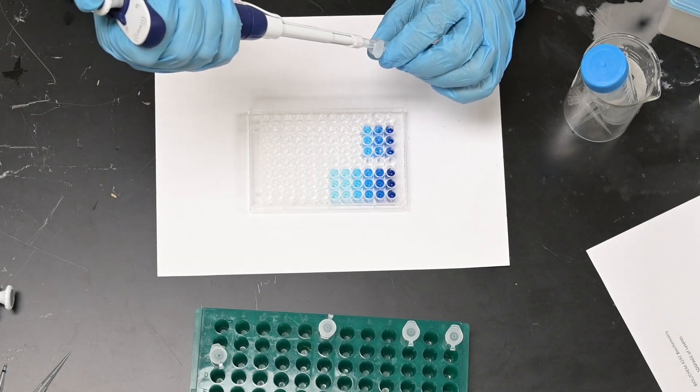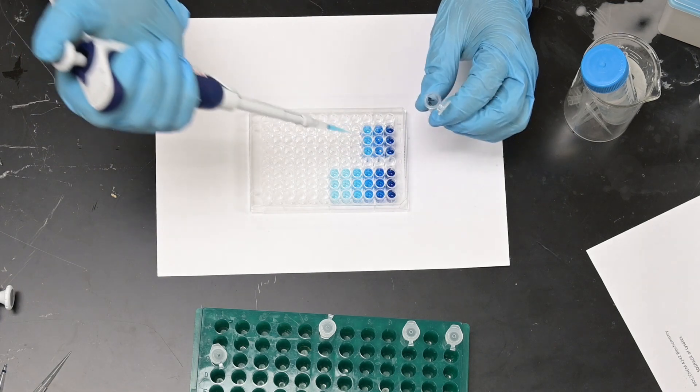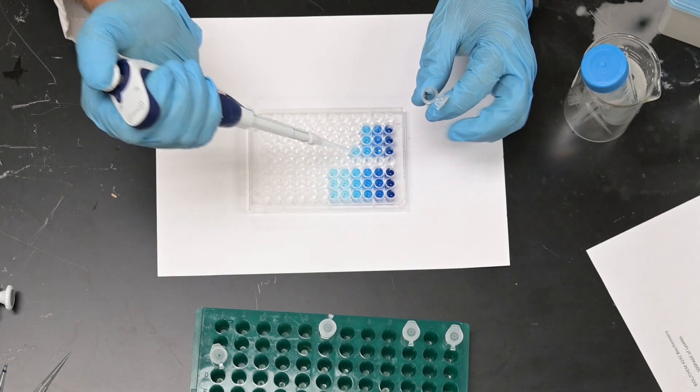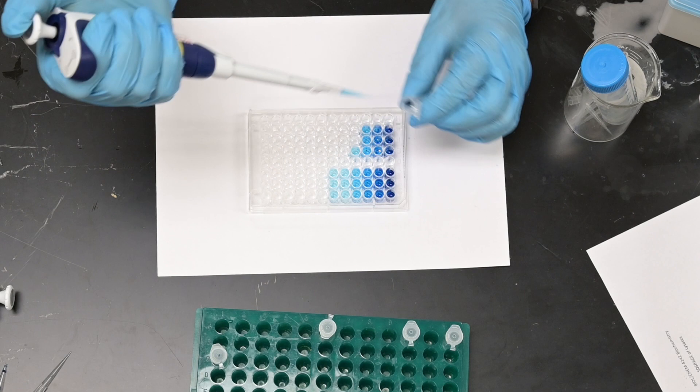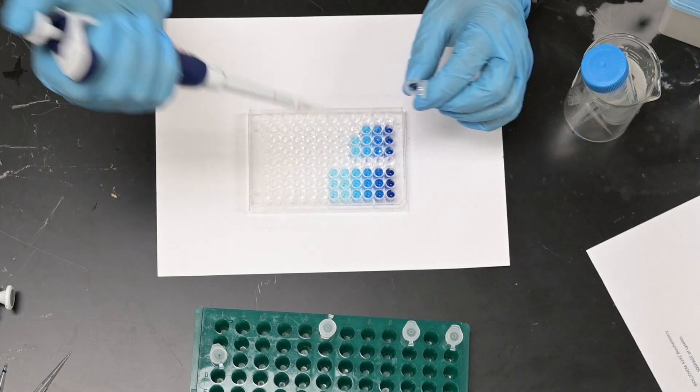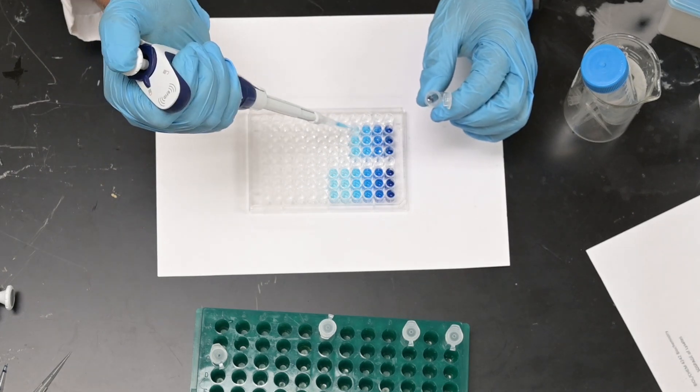Now the one-eighth goes into E4, F4, and G4.